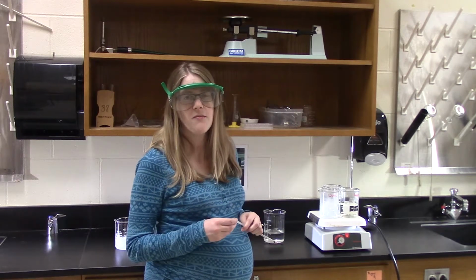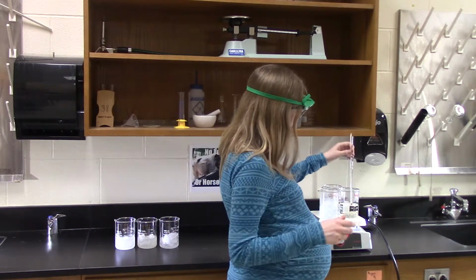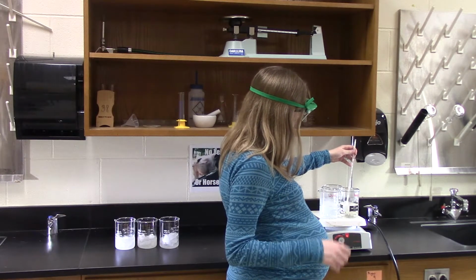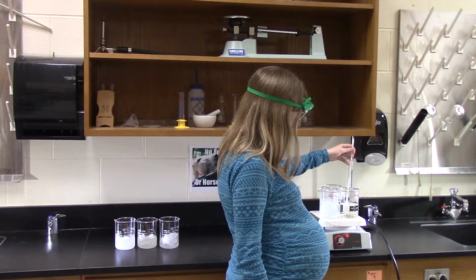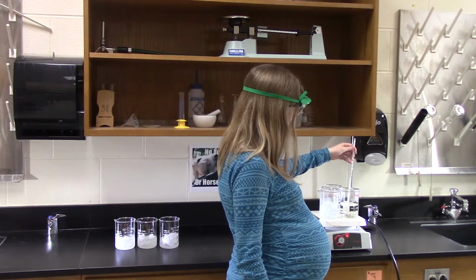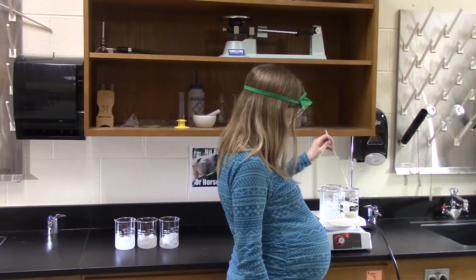Okay, let's check the sugar. If this worked out, it should be higher than 99. Now, typically this demo doesn't have that big drastic differences between them, but let's see if there's a difference at all. Okay, here comes the sugar water. We're expecting to see one that is higher than 99. Yep, and we're looking at right at 100. Good, good. So we can see not a huge difference, but it is boiling at a higher temperature.